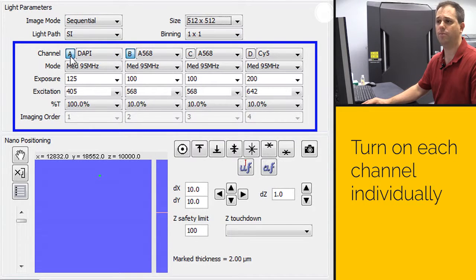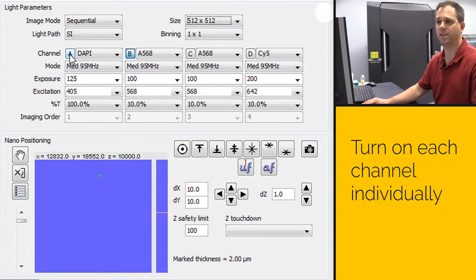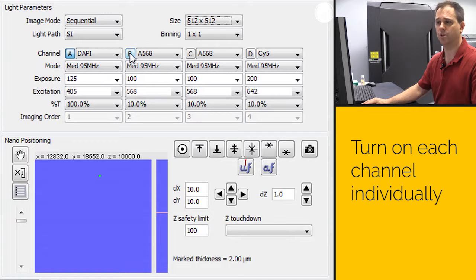For each channel, you have to turn it on by clicking on the appropriate letter. So we'll want to turn on channel A, and we'll turn on channel B.